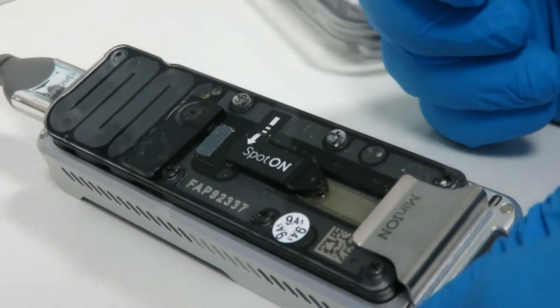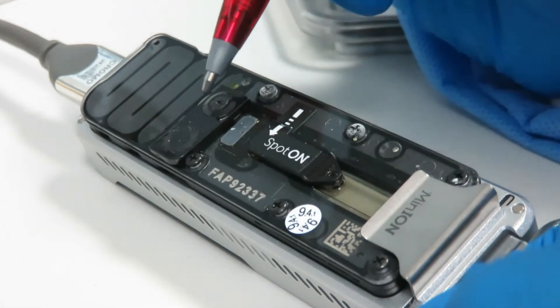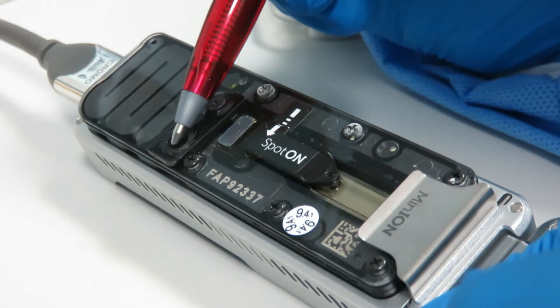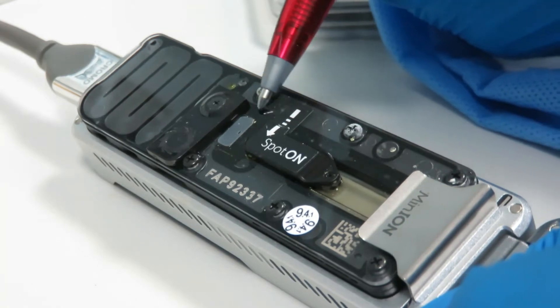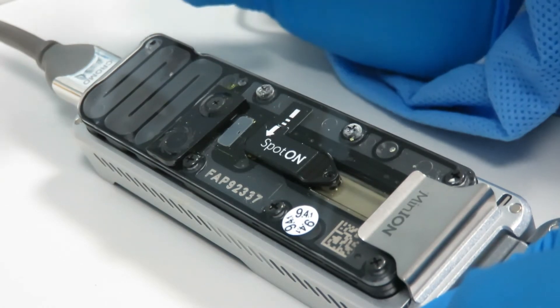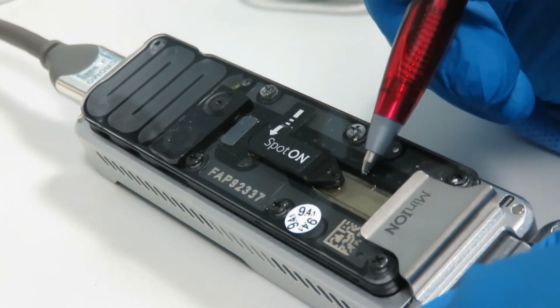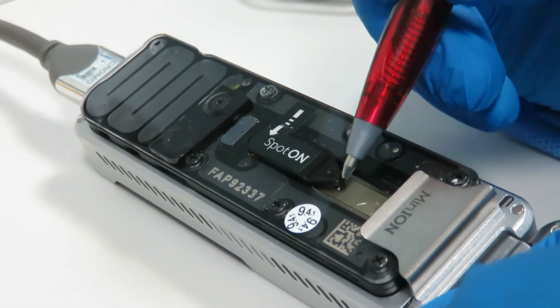The way a flow cell is set up is it's basically a water channel that goes around and through this ASIC panel. You add your buffer into this hole under this flap, and the water channel flows along through here and then down around and out into the waste channel. The one main rule of loading a flow cell is not to introduce air bubbles, because any part of the surface that has air on it will kill the pores and they won't work.